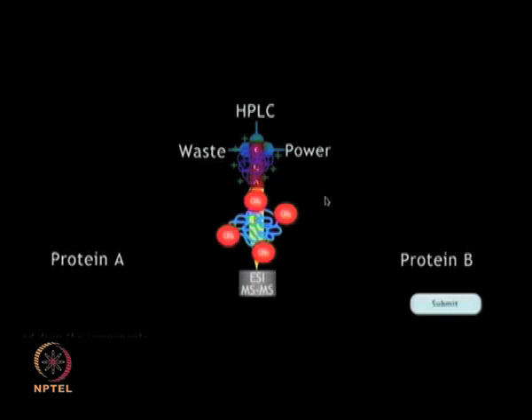It has been shown that MudPIT has the potential to be used as a substitute for traditional two-dimensional gel electrophoresis, since it can separate peptides in 2D liquid chromatography. The MudPIT technique allows greater separation of peptides, which can directly be interfaced with a mass spectrometry ionization source. It also avoids band broadening, which is one of the drawbacks of many chromatographic methods.